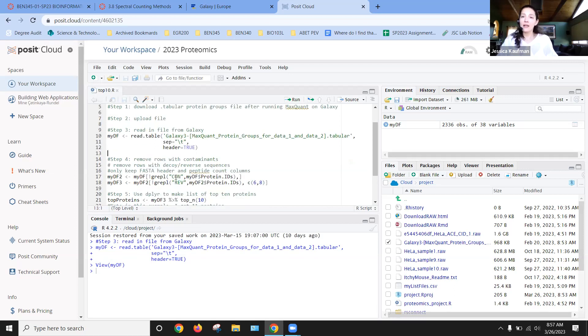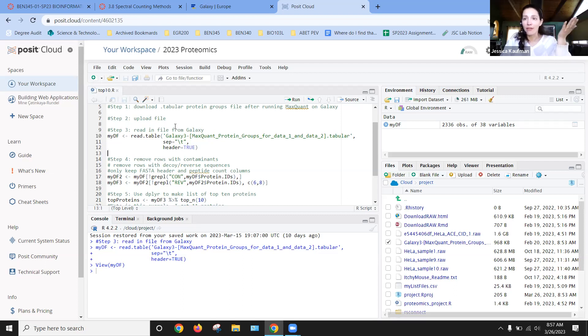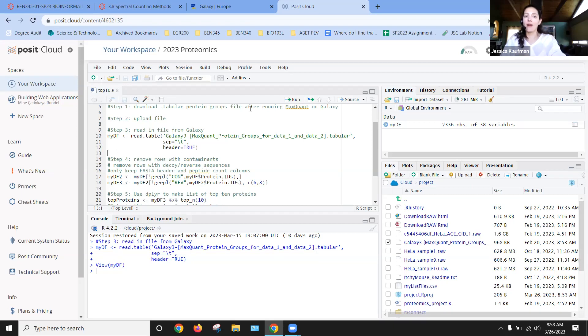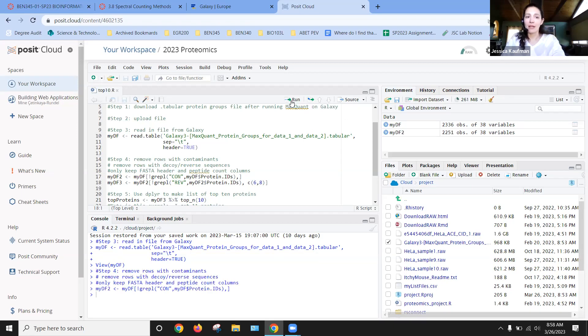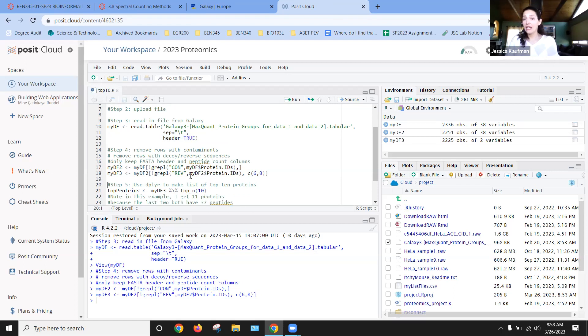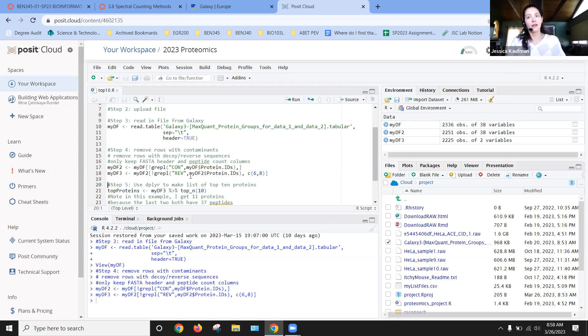The next thing I want to do is I want to get rid of the rows that start CON underscore underscore. All of those are things that the software thinks are contaminants. I don't really care about differences in abundance for proteins that are not of research interest. So I'm going to remove all the rows that have contaminants and also all the rows that have decoys. So you watch the video on how MaxQuant works, how it creates target decoy sequences by just reversing the amino acids.